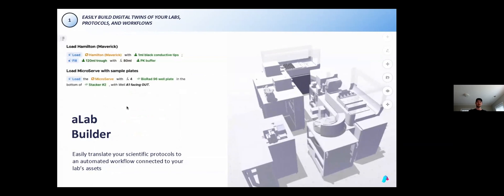In the assistant builder, you can also create associations of quantities for loading the system, for example, a 4 to 1 ratio of tips to samples, or calculate the required reagent quantities based on the number of plates.